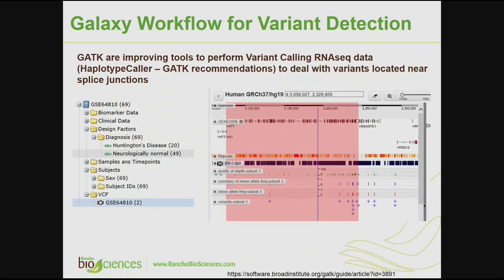GATK are improving tools to perform variant calling for RNA-seq data. The GATK website recommends the HaplotypeCaller to deal with variants located near splice junctions in RNA-seq data. We were able to process a small sample of data given the capabilities available to a free Galaxy user, and here is the output VCF file. We loaded this VCF file into Transmart.